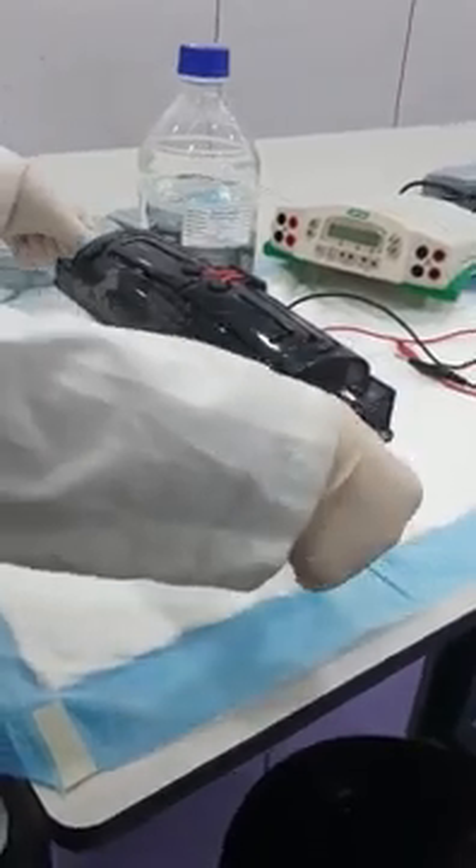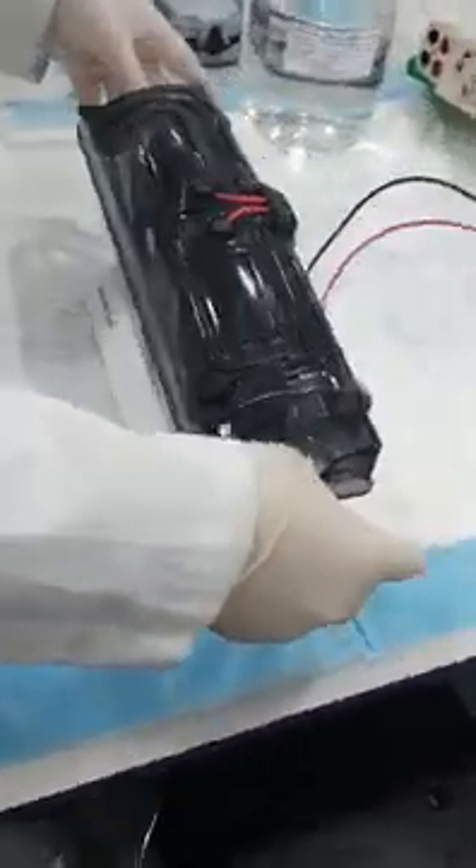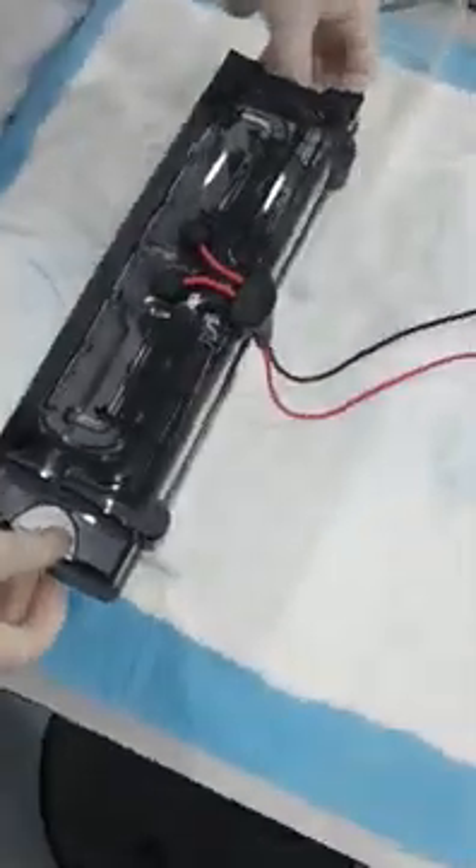This is the gel tank. You can remove the cover by pressing the thumb here, then using the finger to lift here like this. This is the hole and you can see the electrode here and here.